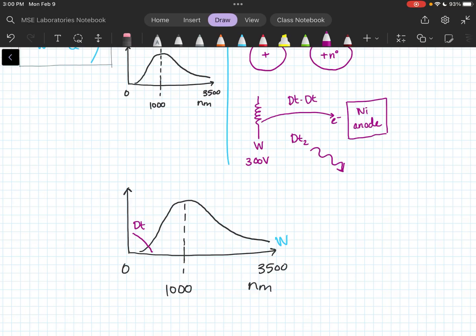Yep, because it only does those tiny little UV wavelengths. There is a little bit of overlap between them, right around the 400 to 500 nanometer range, maybe the 300 to 500 nanometer range. So there's a little bit of overlap. It's not a ton of overlap though.